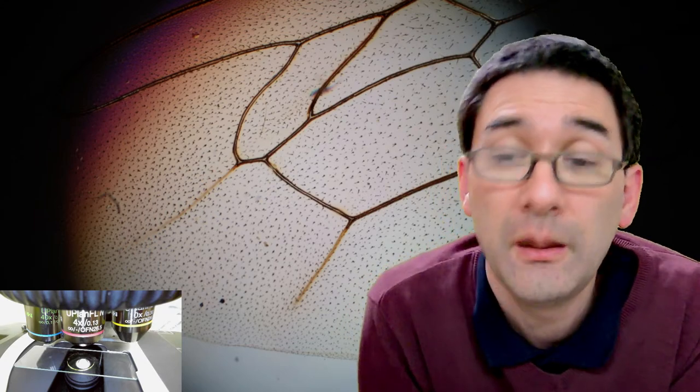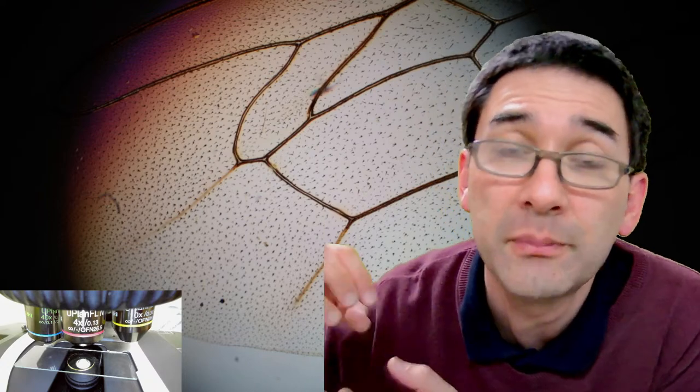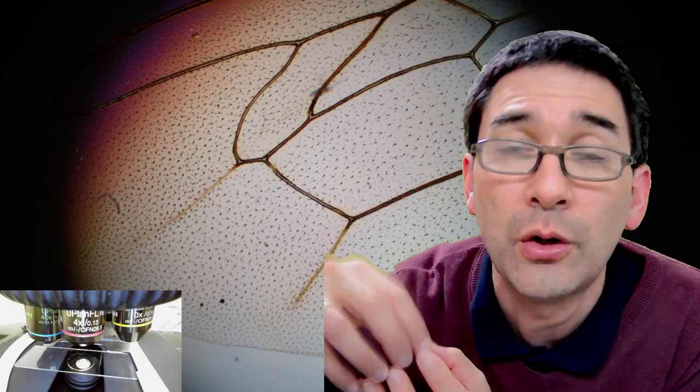So that is something that I would think would be worth trying out, this type of UV-sensitive or UV-hardening nail polish. I have not tried it out, but I can imagine the following advantage: because there is no evaporating solvent, there should also not be any shrinkage. Usually there's shrinking, and bubble formation is always an issue. If the mounting medium starts to shrink, then tensions start to appear, and sometimes this causes the formation of bubbles, and sometimes even the cover glass not to stay on very strongly.